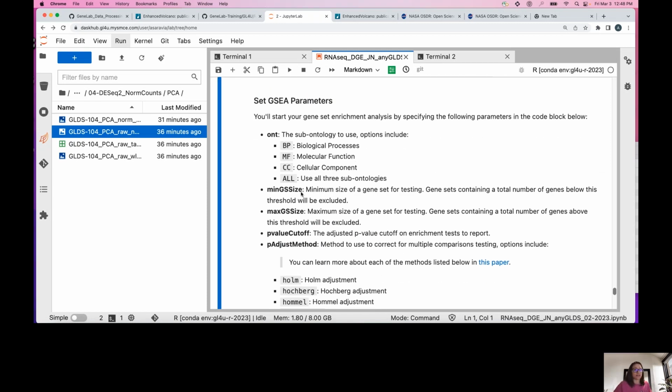So this is very useful. Yeah, very useful. I thought we would export it to Excel and rank over Excel, but this is great. Yeah, don't even have to do that. Do it right here.